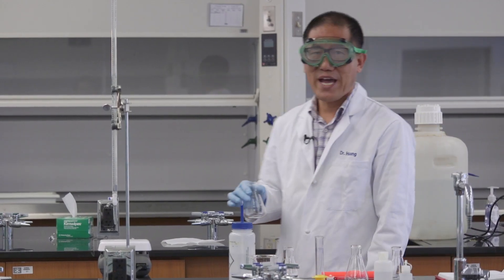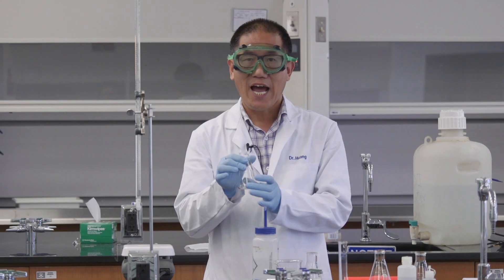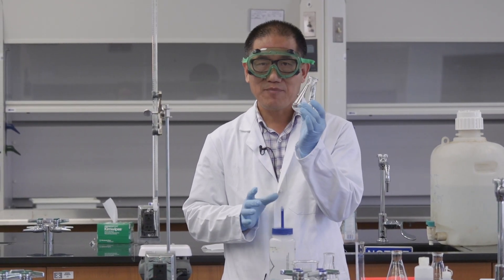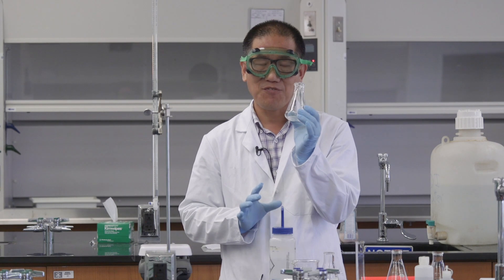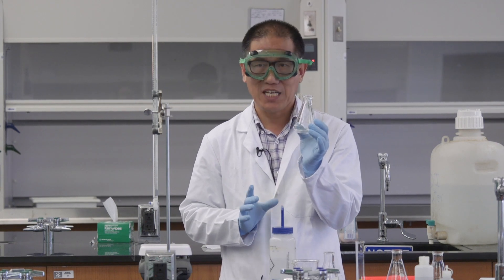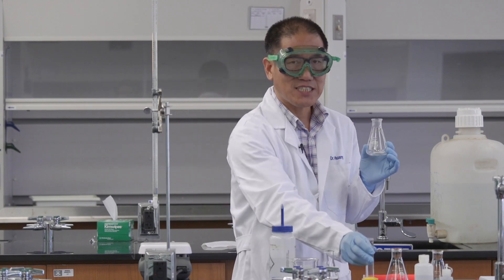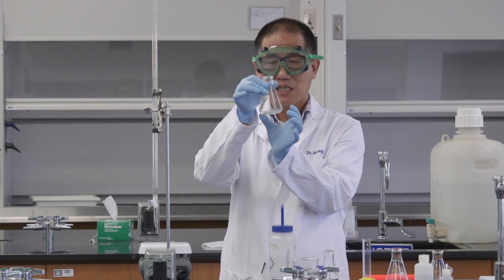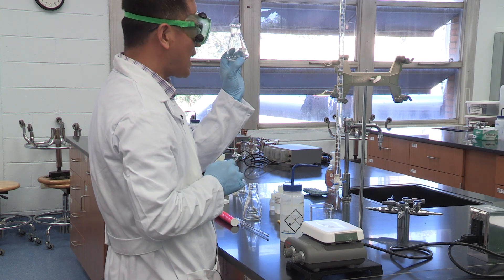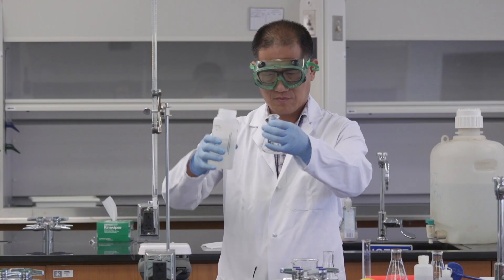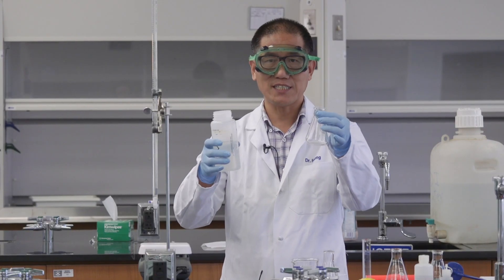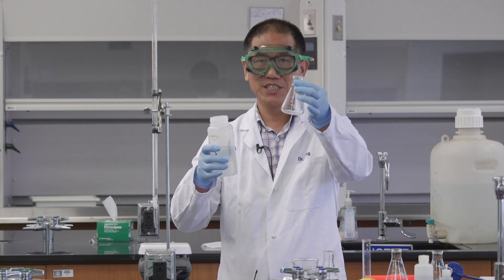Now we are moving back to our titration station. I need to add water to dissolve this. It doesn't matter how much water you add, but roughly you want about 25 milliliters. You can use a graduated cylinder or you just estimate. Use a mark on this Erlenmeyer flask. I'm not going to use a graduated cylinder because I think I have a pretty good estimate.